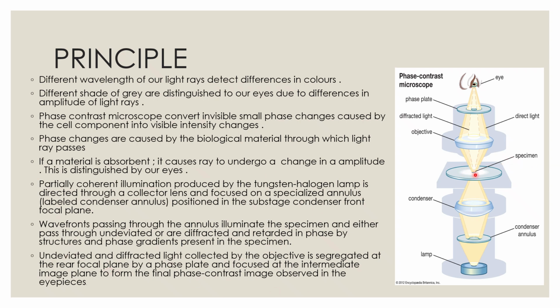There is another type of light, which is called diffracted light. As the name tells, diffracted light is the light that has been scattered by the specimen. Light passes through the specimen and gets scattered due to interactions with its internal structures, such as organelles and other components. The undeviated light mostly passes through the slide and does not get deviated, and hence we call it undeviated light.